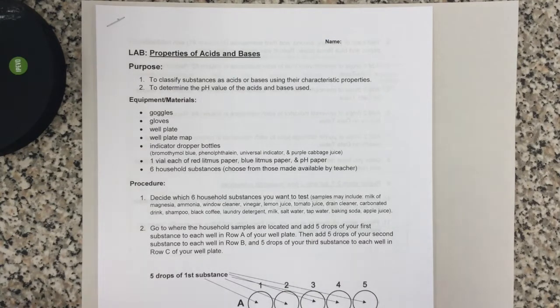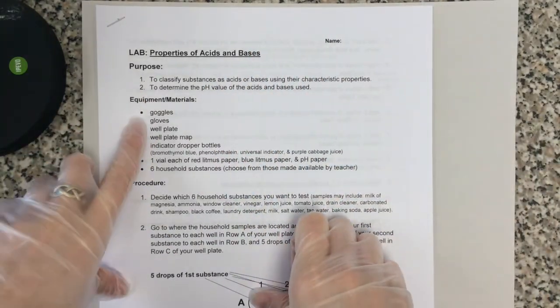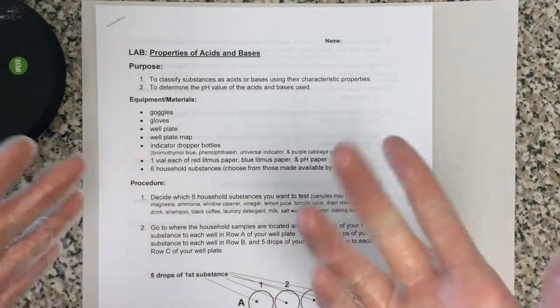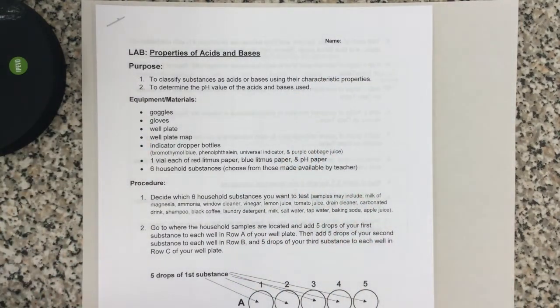We need some gloves and goggles. Got my gloves, got my goggles on as well. Very important, especially if you're testing acids and bases and you don't know how strong they are. You definitely want to make sure that your hands and your eyes are protected because acids and bases can be corrosive, and you want to protect your skin and your eyes.